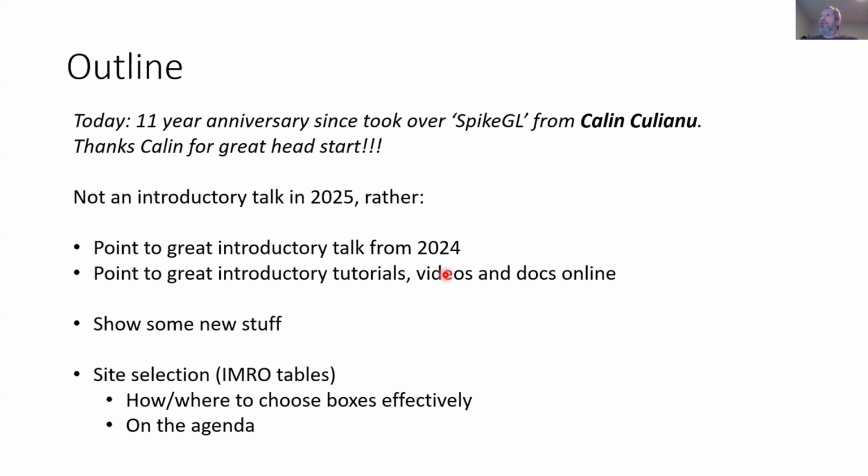In this talk, I'm not going to go over all the features of SpikeGLX because I've done that in prior years. Instead, I'm going to point to where you can find introductory materials on the web, give some orientation, show some new things that we've put in recently, and talk about a particular area that I think more people should be aware of, which is how to effectively select sites on your probe.